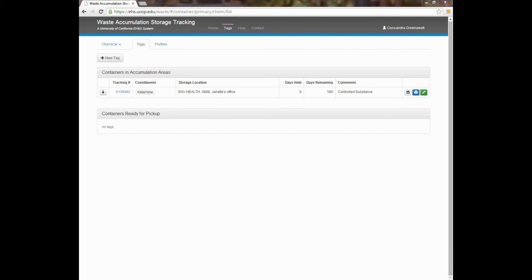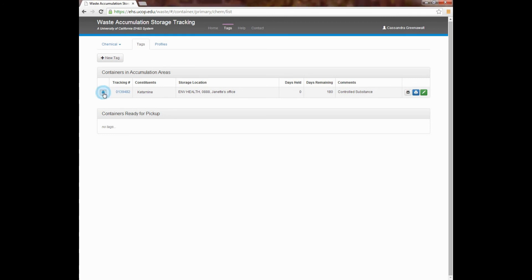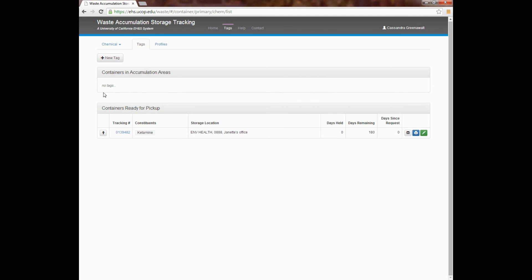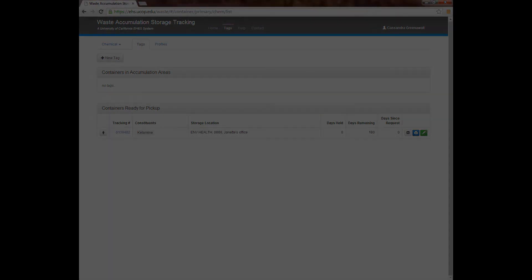Once you click on Save, you will be returned to the Tags section where you can view your label under the Containers in Accumulation Areas section. When a container is full, you can use this section to schedule a pickup. To do this, locate the appropriate tag. Then click on the arrow icon to add it to the Containers Ready for Pickup section. When you move containers out of the accumulation area, it will then notify EH&S that it needs to be picked up. Please note that your waste will not be picked up unless it is listed in this section here.